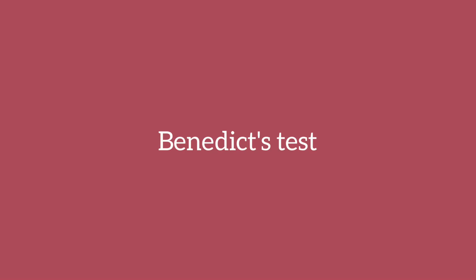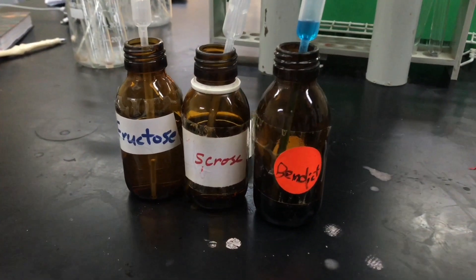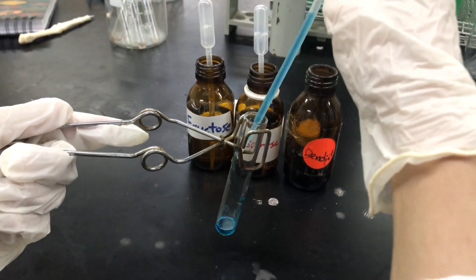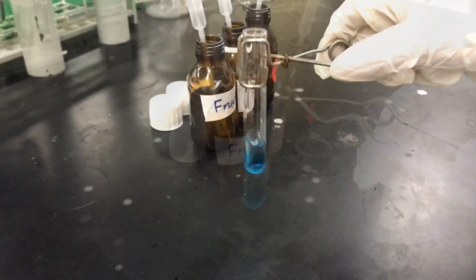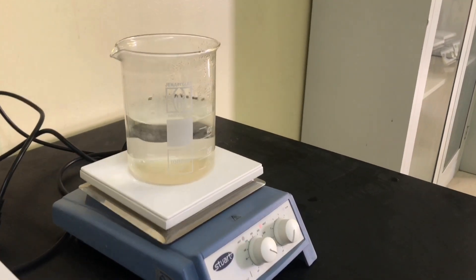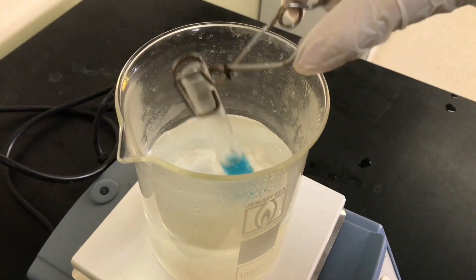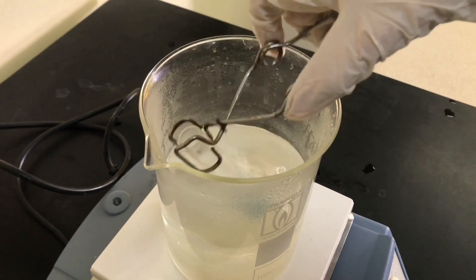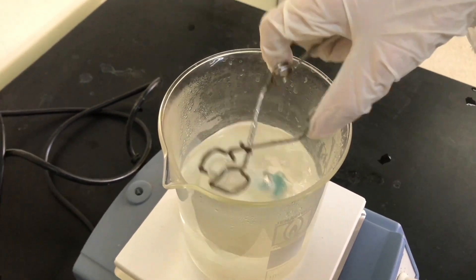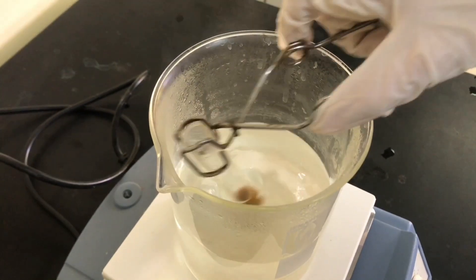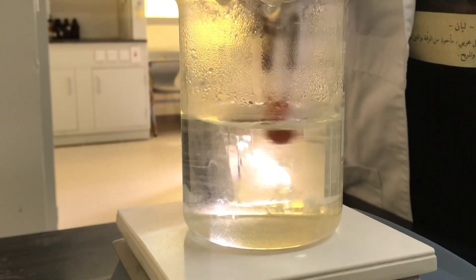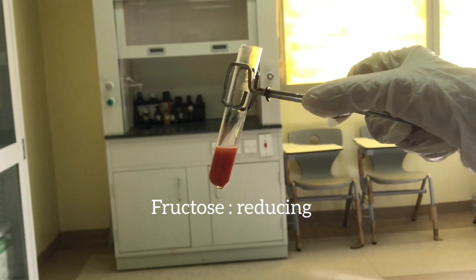Moving on to Benedict's test, which also aims to identify if the sugar is a reducing or non-reducing sugar. You're going to need Benedict's reagent, a reducing sugar like fructose, and a non-reducing sugar like sucrose. Add two mils of Benedict's reagent, then add five drops of a reducing sugar like fructose. Shake well, then carefully heat in a water bath for five minutes — be patient and shake while heating. You're going to observe a change of color into red, indicating the presence of a reducing sugar. The color might vary from bright orange to red to reddish brown depending on the reducing sugar used. As we used fructose, it turned out to be a really bright orange-reddish color. This is the result for a reducing sugar.